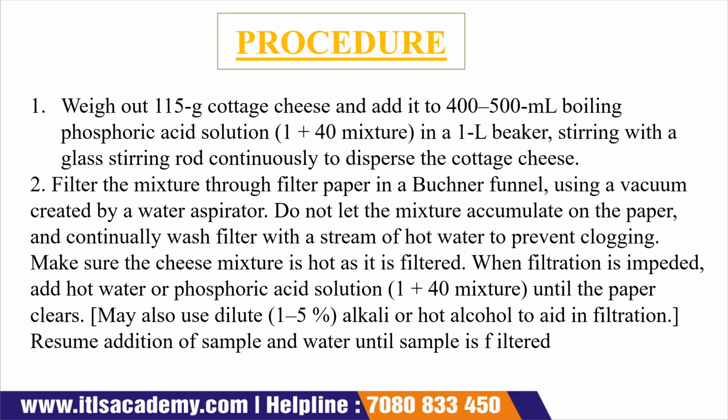Now the next one is your procedure. First of all, we have to weigh the cottage cheese, around 115 gram. Then after that we have to add 400 to 500 ml of boiling phosphoric acid solution in a 1 liter beaker. Suppose that this is your 1 liter beaker.